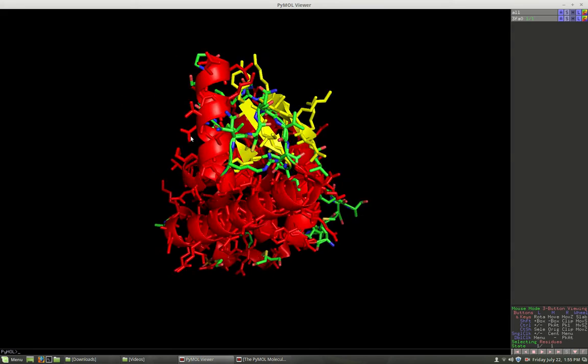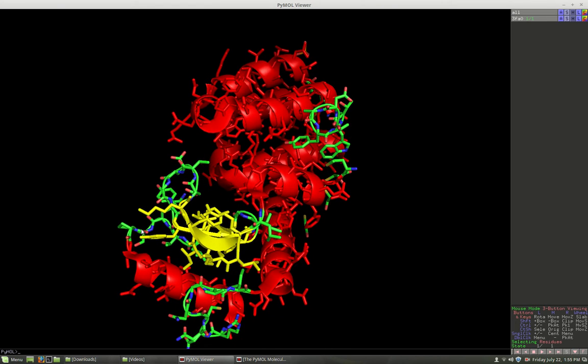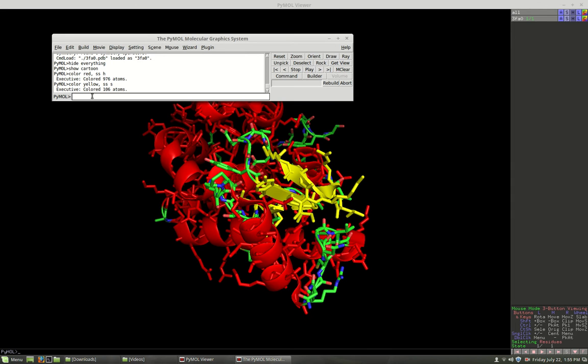So that's indicating those are still there. But we get to see some of the chemistry of the other things, see if those are odd or different in some way. So we're going to look at this, and we're going to pick out particular residues, particular amino acids that are of interest to us. In particular, I'm going to pick out residue 22, sorry. First I'm going to hide all the sticks again.